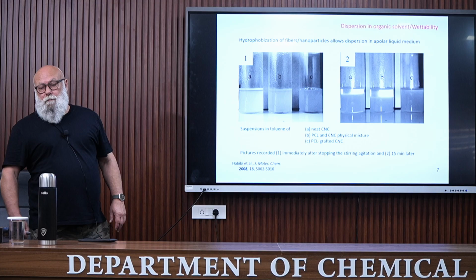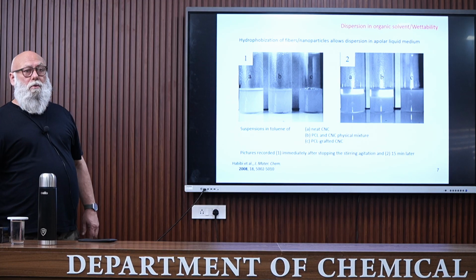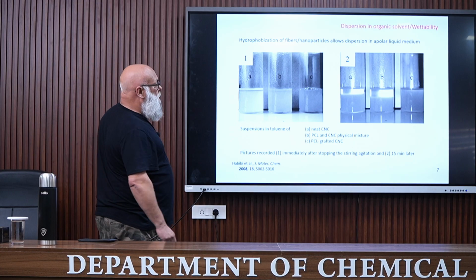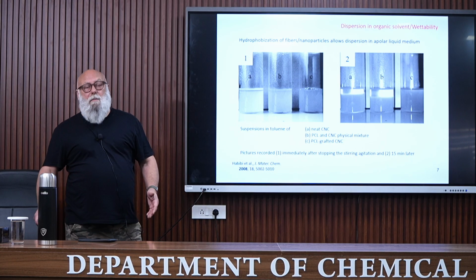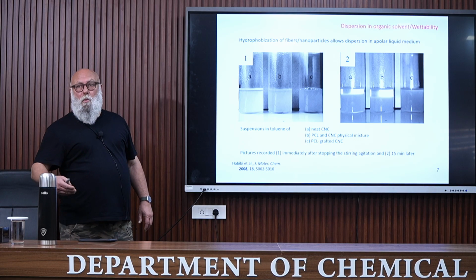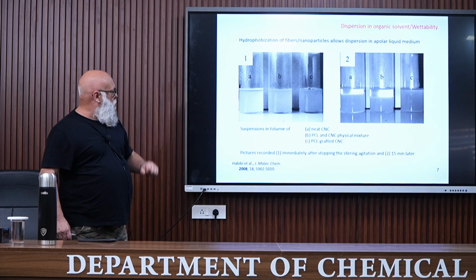Another technique to evaluate the grafting efficiency is to disperse the grafted fibers or grafted nanoparticles in organic solvents. So it's a wettability test. I will show you some examples.